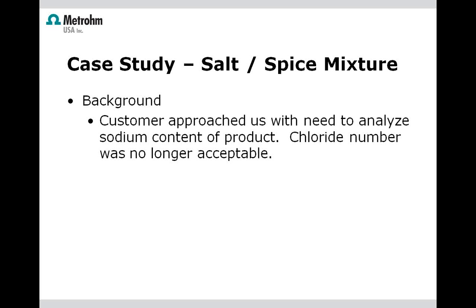Now, I'd like to look at a case study that was done here at Metrohm USA, just to emphasize some key points about the thermometric titration. In the case study, we did the salt determination in a spice mixture. This spice mixture was provided by a customer that was interested in the sodium content in that product. Chloride determination was no longer the appropriate method for them, as they needed to know the direct sodium content, not expressing the sodium content by determining the chloride content, which is the conventional way of doing salt determination.